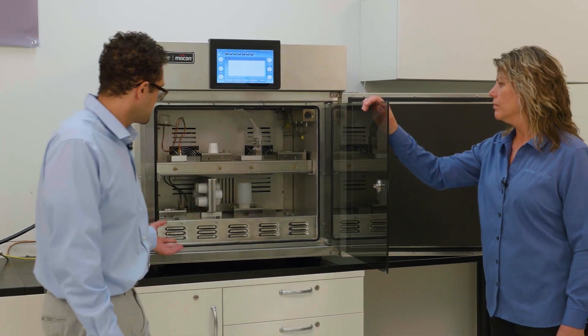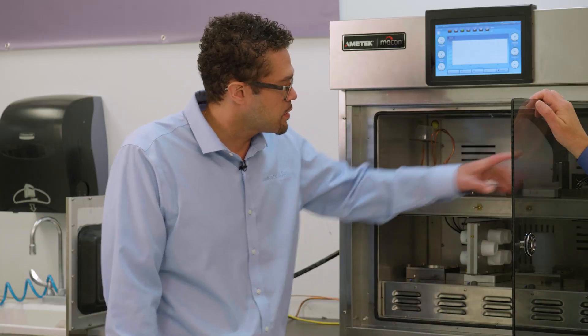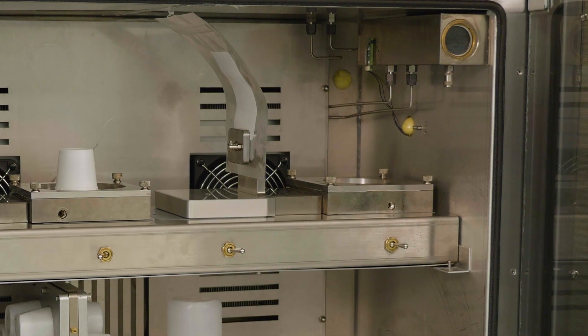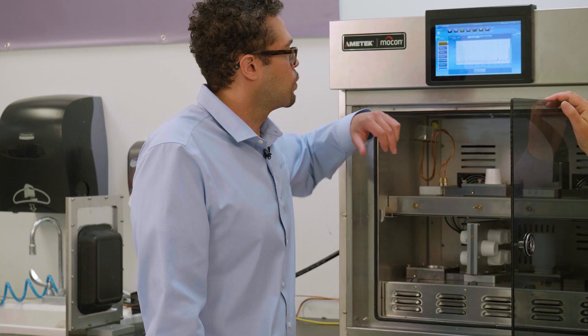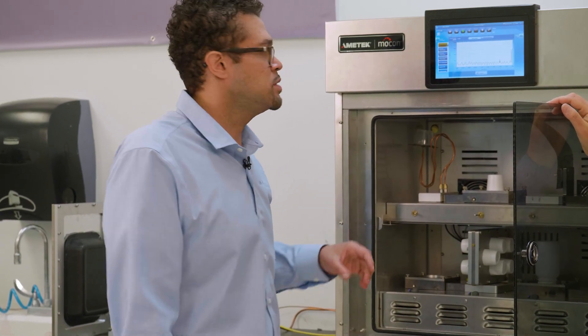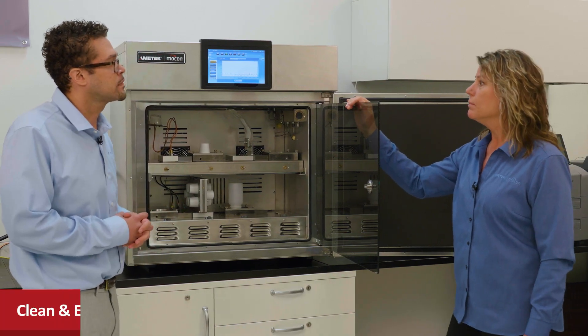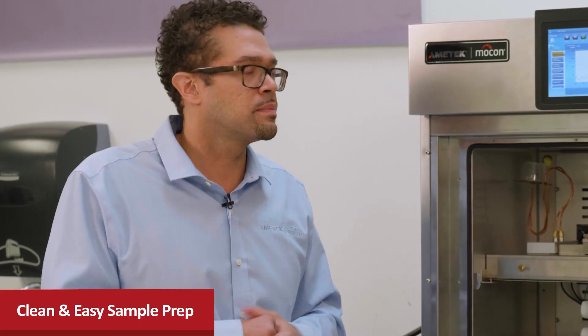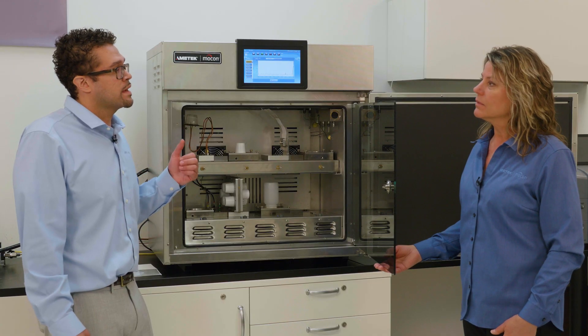As we look inside here, we have the ability to test four samples simultaneously. We have the RH generator here, and everything's very tightly monitored, even to the point where you can look on the software and pull up what the past temperature and RH was doing. You can monitor and see how tightly this is really controlled. For a technician, it's quite easy — the ease of use feature goes up 100% with this. It seems like that's going to really improve repeatability, and it also improves accuracy.